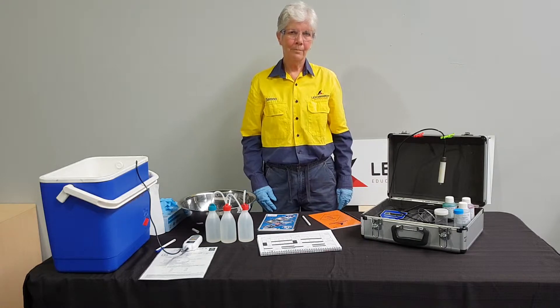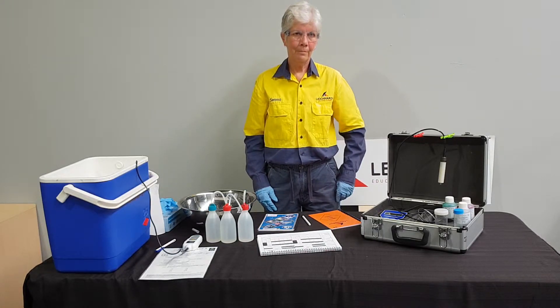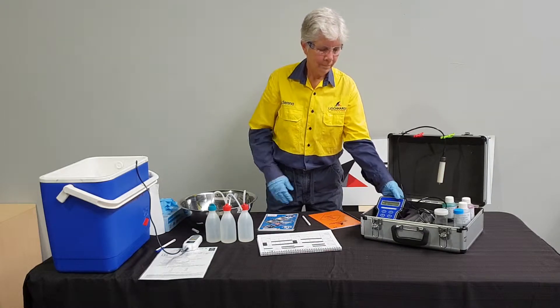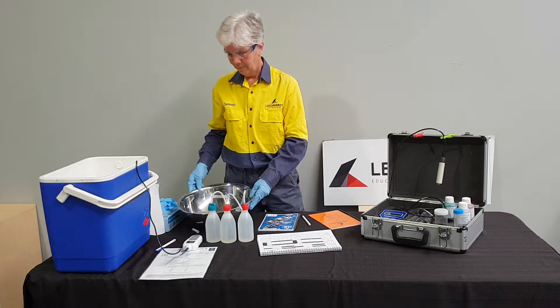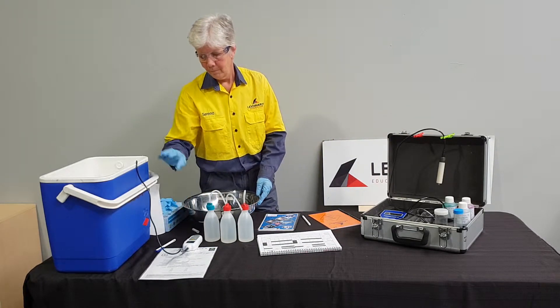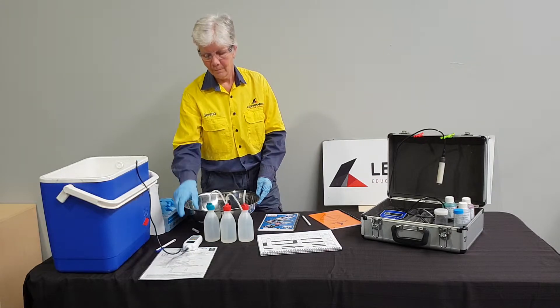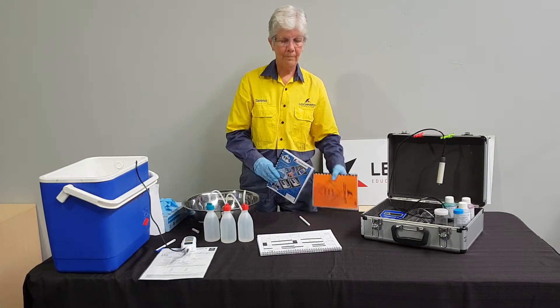Before we start, Serena will show you the equipment needed to perform this calibration. We require a WP81 metre with a temperature and conductivity probe, a bowl and deionised water for triple rinsing of the probes, a water bath with certified thermometer, and an operating manual, safety data sheets and calibration record sheet.